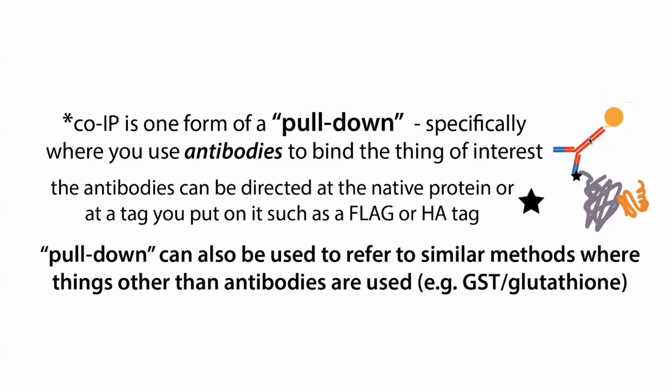In that case, the binding is non-covalent, so it's not permanent. And so you do have to worry about your antibody potentially coming off the column if your elution conditions are too harsh, and this can interfere with some later processing, as I'll get into. When you buy ones like the anti-HA, they're often covalently attached, so they're permanently attached to the beads, which makes it less of a concern about those antibodies coming off the column.